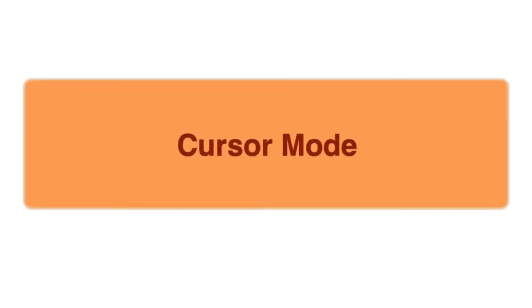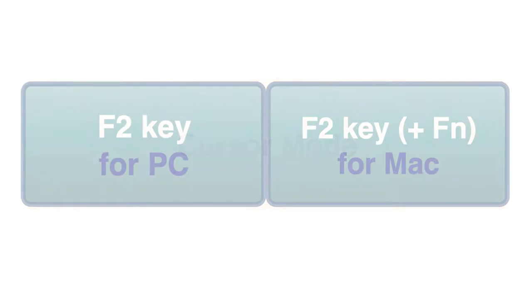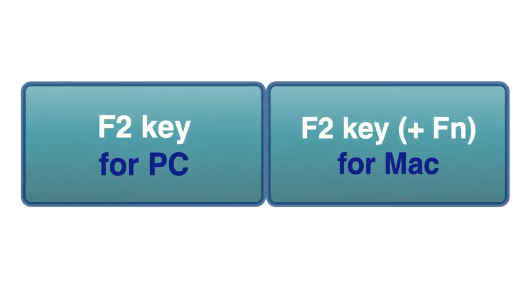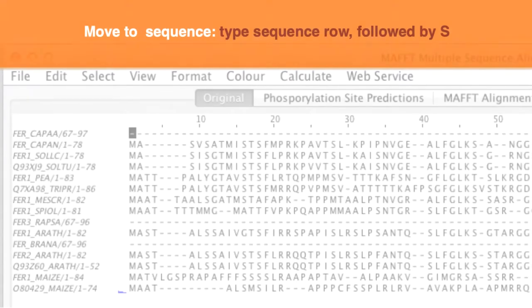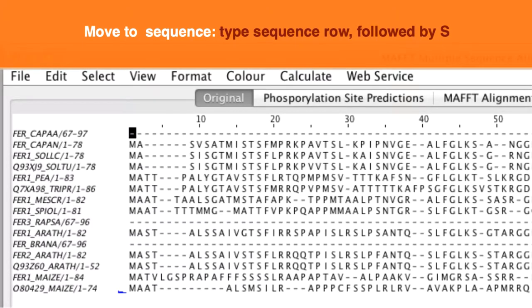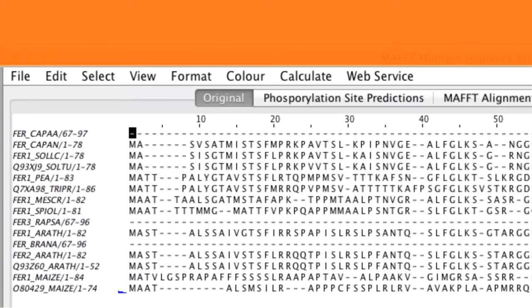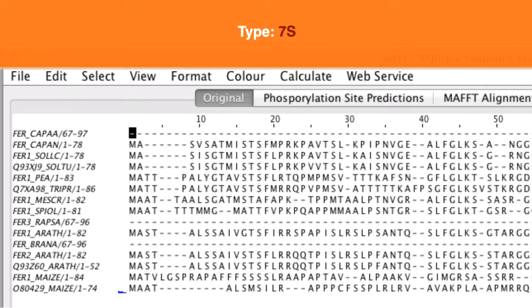If we now enter the cursor mode using the F2 function key you can use the keyboard to jump to precise locations. So to move to a sequence of interest you type the row that that sequence is located in followed by S. So to move to sequence row 7 type 7S.